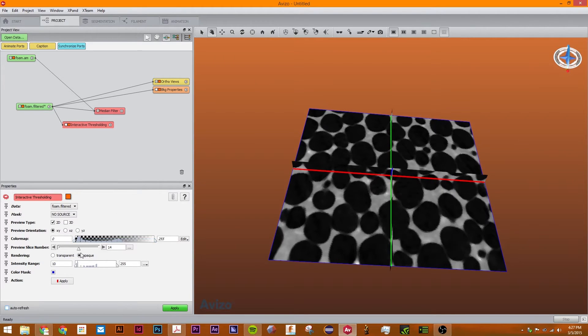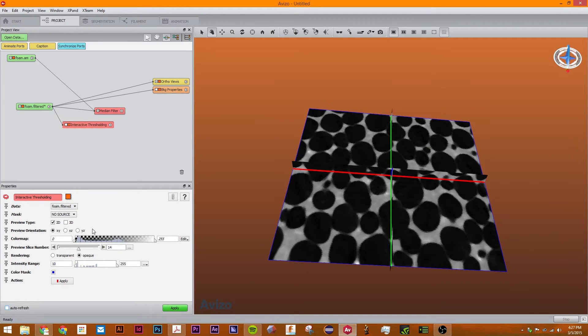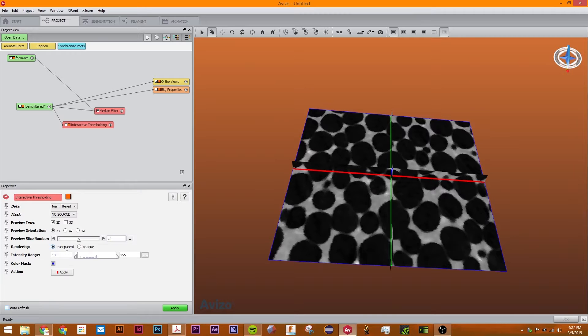Interactive thresholding basically takes a grayscale image which has 32, 16 or 8 bit values per pixel and turns it into a binary image which has only two possibilities. One for the pixels of interest and one for the background. That means I can transform this into transparent.